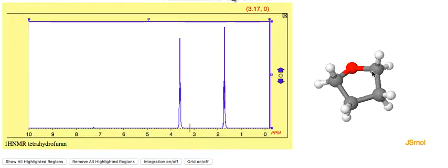And we've got the ones that are closer to the oxygen. These are equivalent to each other, these 4 hydrogens. And we've got the ones that are further from the oxygen. So which peak do you think is going to be the ones that are closer to the oxygen? Well, hopefully you thought that one through. But this is closer to the oxygen, is more de-shielded, it's more downfield. And notice that it is a triplet.